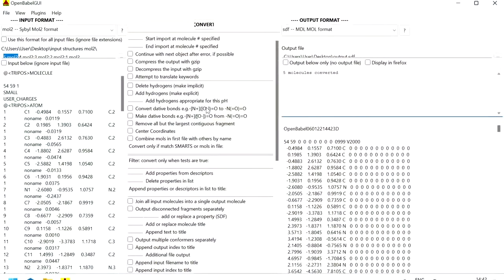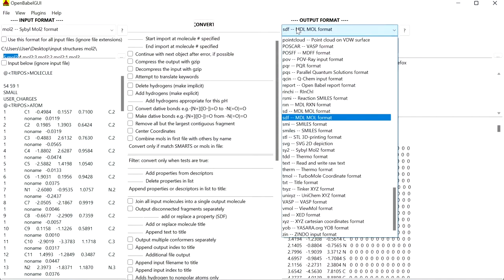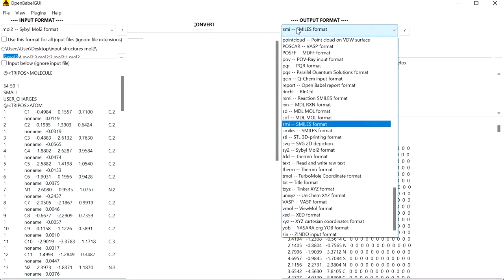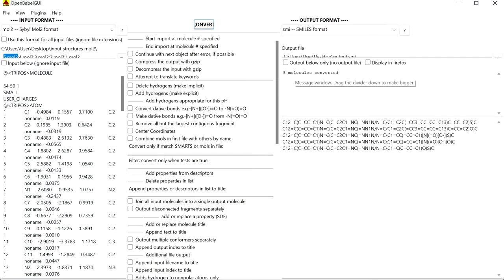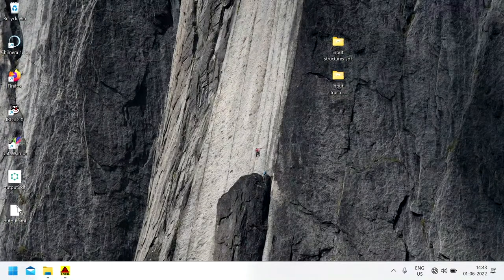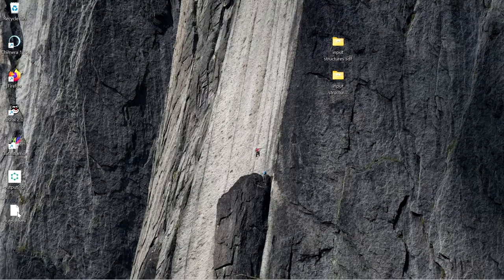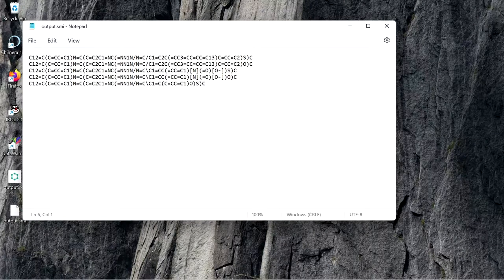In a similar way you can convert to other file formats also, for example smiles. Change the output format to smiles and output file name to output.smi, and click on Convert. You do not need to check the option to join all input molecules into a single output molecule — just click on Convert. Now you can see these five molecules are converted. In the desktop you will find output.smi, which contains five individual SMILES notations inside this single file.